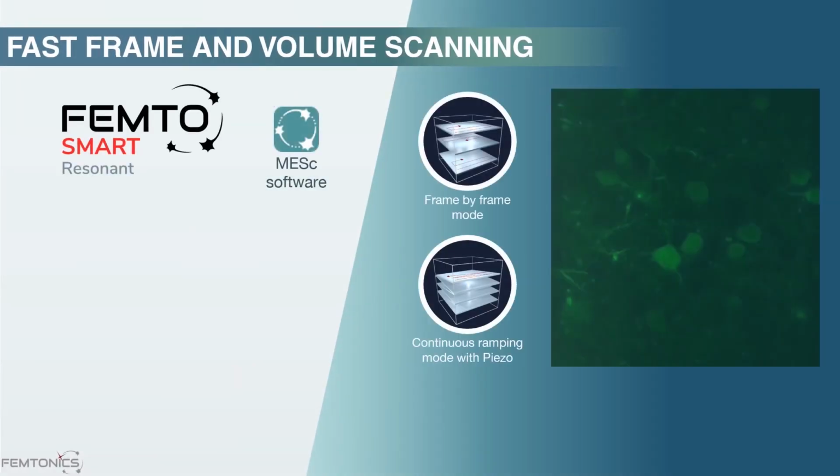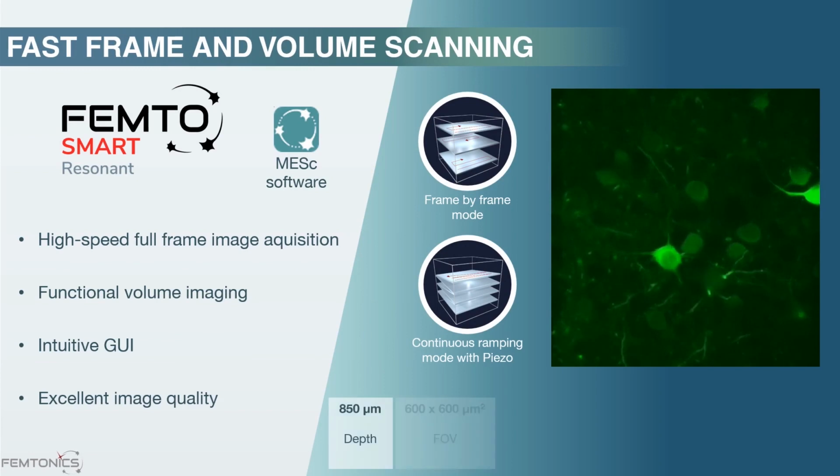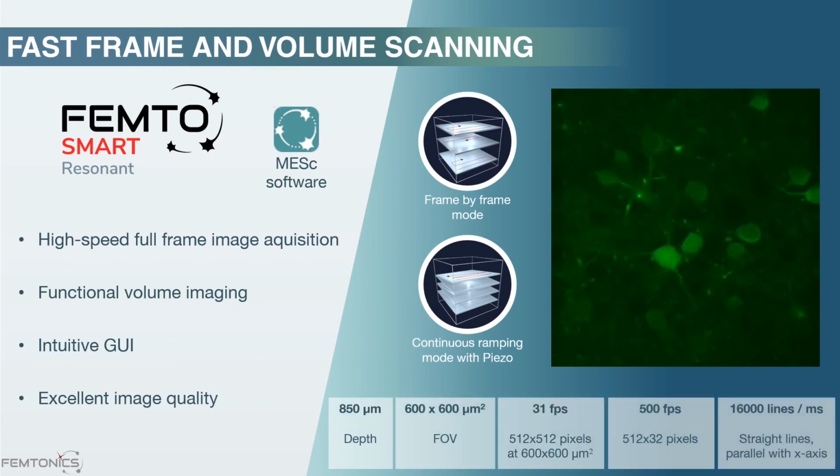As mentioned, we're using the fastest Galvo scanners available today, but their speed is a limitation if one would like to expand the region of interest to a full frame. In this case, resonant scanners can be used, enabling faster sampling. Resonant mirrors resonate and guide the laser beam at a given frequency, which is 8 kHz in most cases.